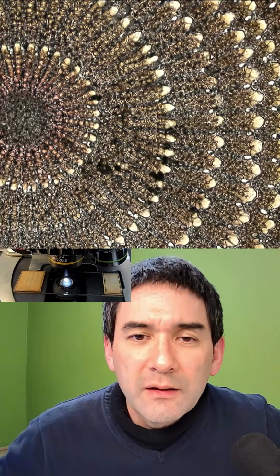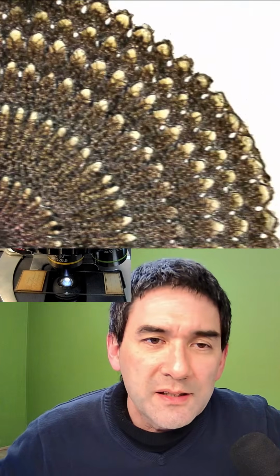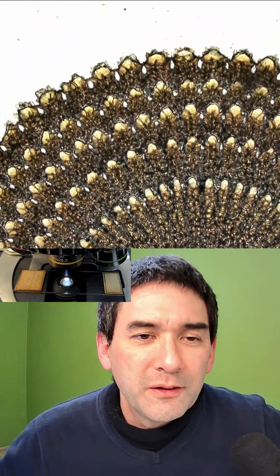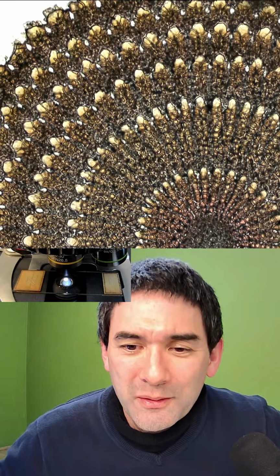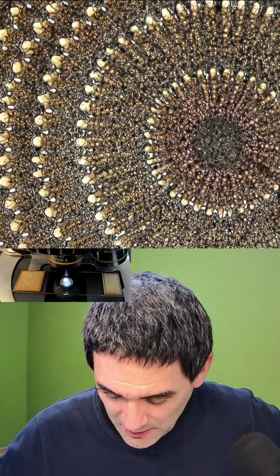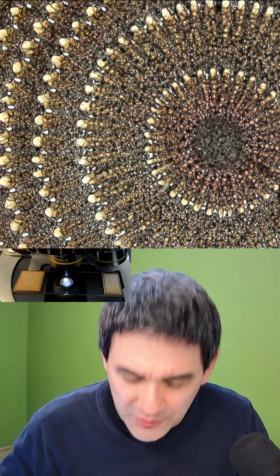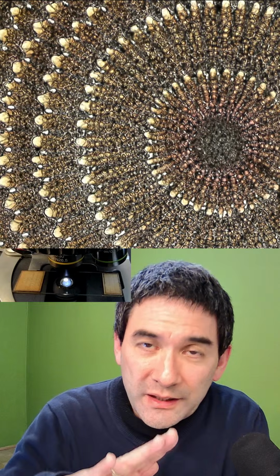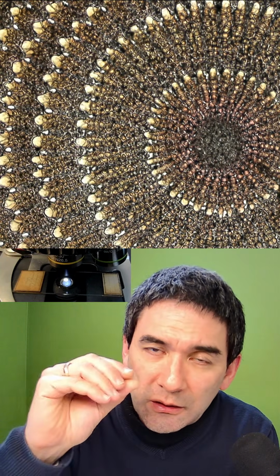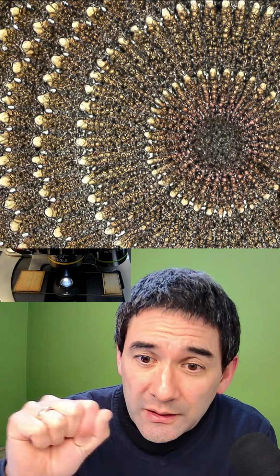Again, if you've been watching some of my videos over the last couple of months, I've already shown them before. Looks very nice. But again, as I mentioned before, it's a little bit of a miracle to me how they were able to do that. And I think what they've done is they've actually glued the sea urchin spine on the slide and kind of polished it down, right?